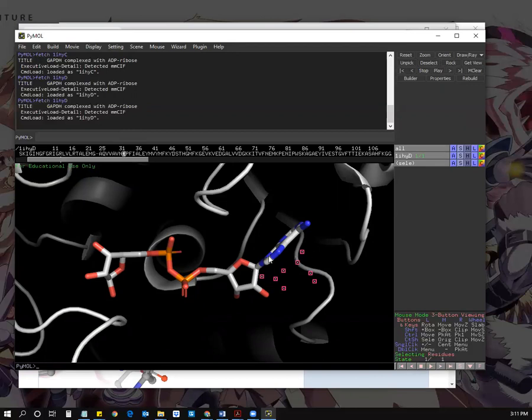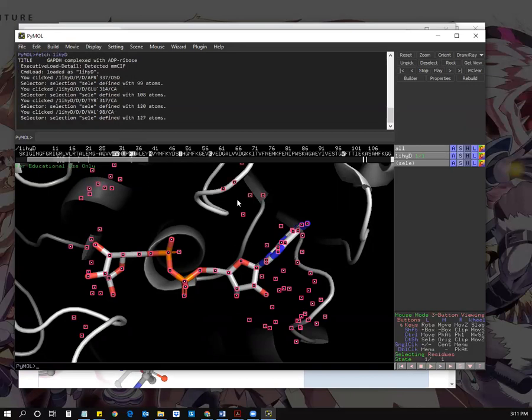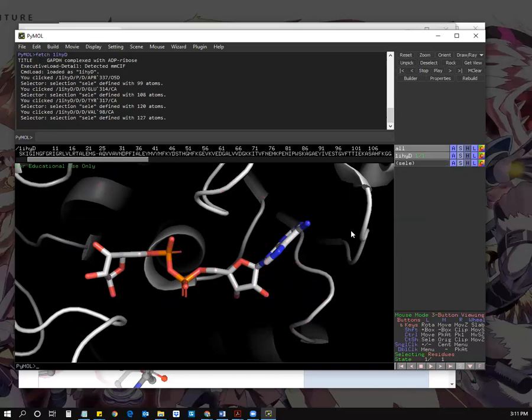I'll select it, and now I can see, one thing about selecting is that it's really weird. You don't need to press shift or hold it down. Anything that you are selecting continues to get selected and grouped. And so this is kind of a little annoying, especially if you don't realize this, perform a command, and now you've done something that looks a little messy. So to unselect, essentially just click on some black space here in the graphics user interface panel.